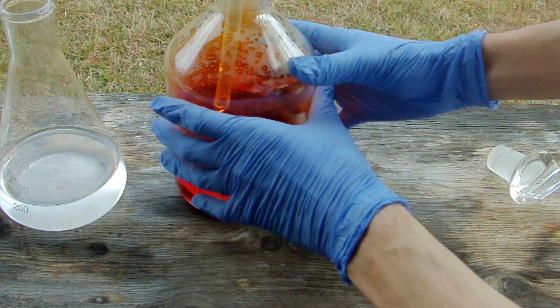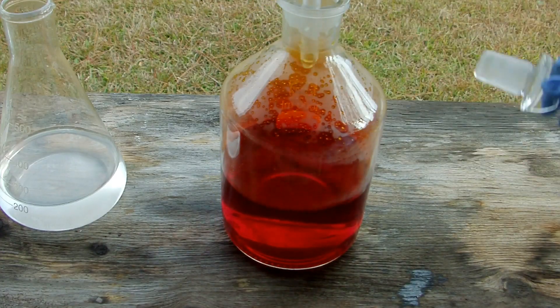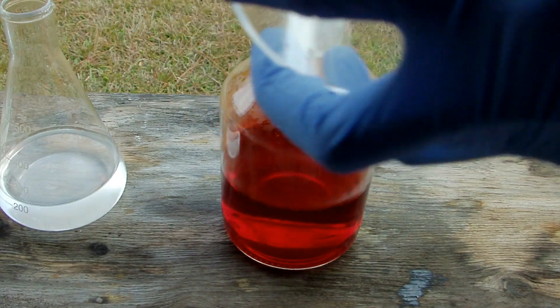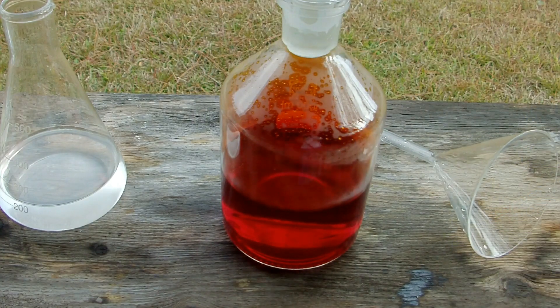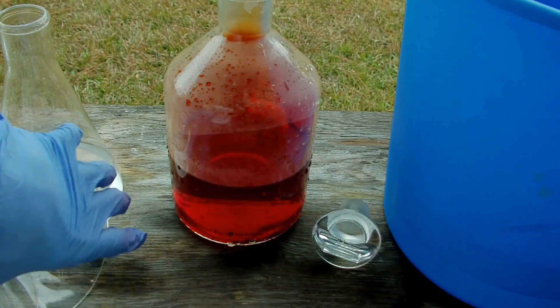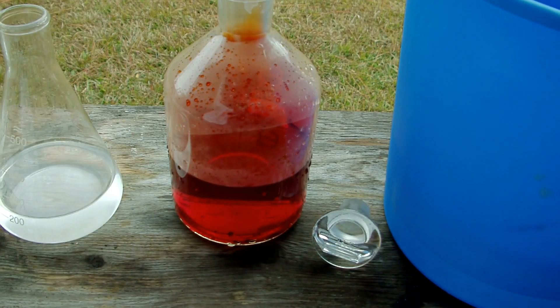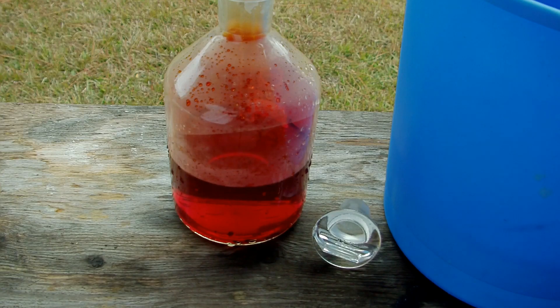In between additions I'll take the funnel out, stopper it, and give it a minute to cool. I've got a bucket of chilled water that I've been putting the flask into in between additions. You can see all the fumes come out — that's why I'm doing this outside. Let's add another addition of acid.